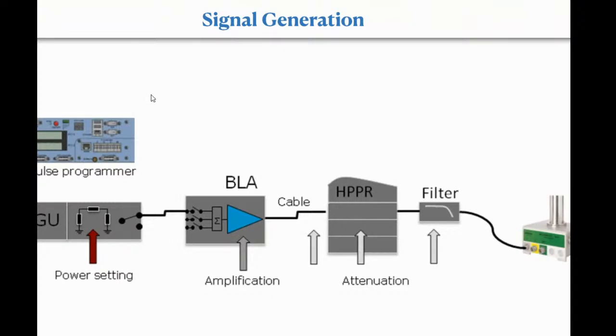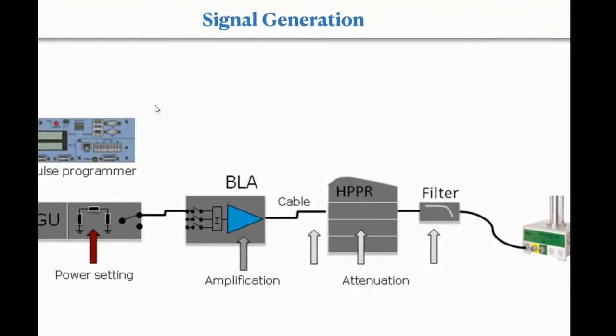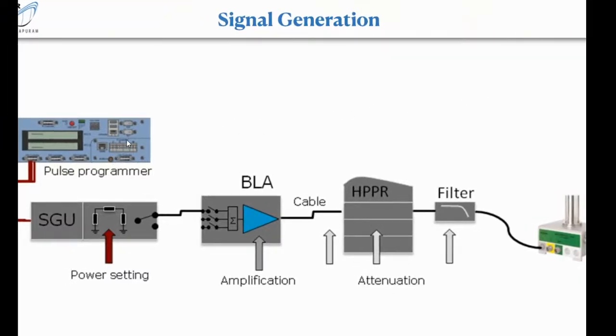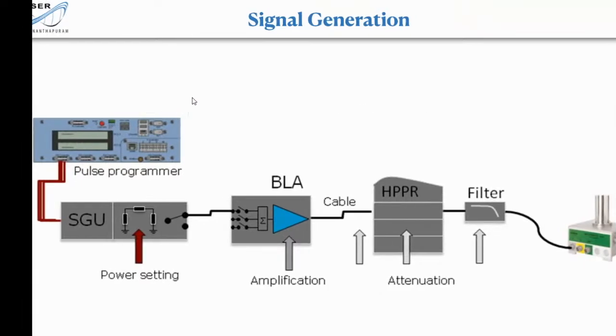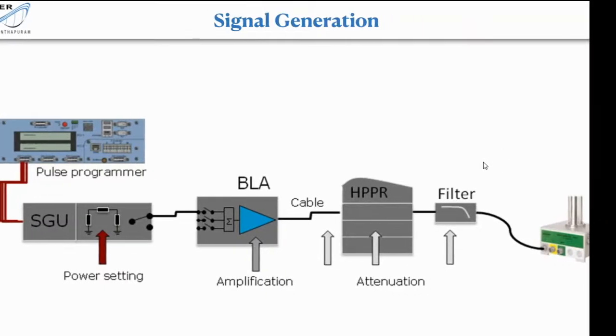All right. So this is how all the important parts of NMR are. Each of these costs a huge amount of money. For example, a probe costs around 25 lakhs. The spectrometers themselves cost around 1 crore or 1.5 crores, depending on the simplest of them. Okay, I hope I have given you a basic idea about how these things are. Unless we actually show you, it is not really possible.